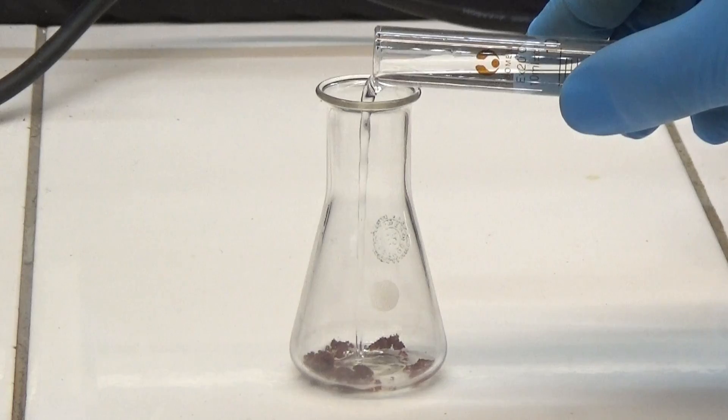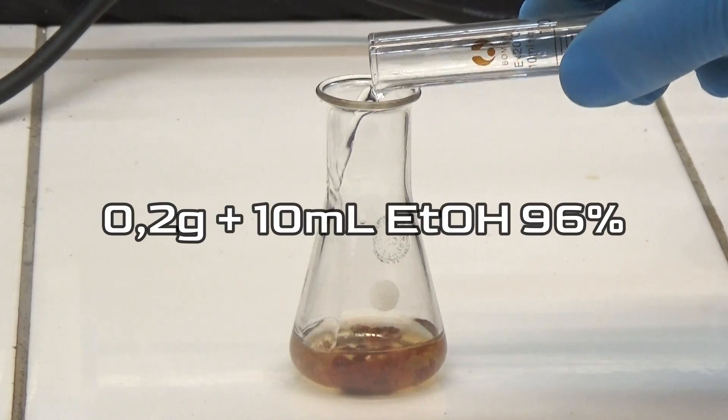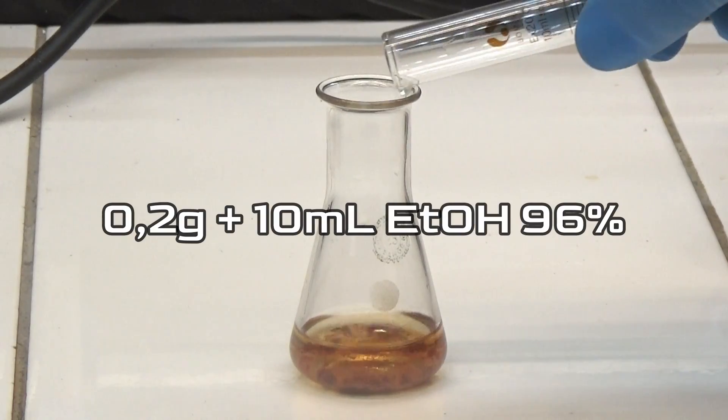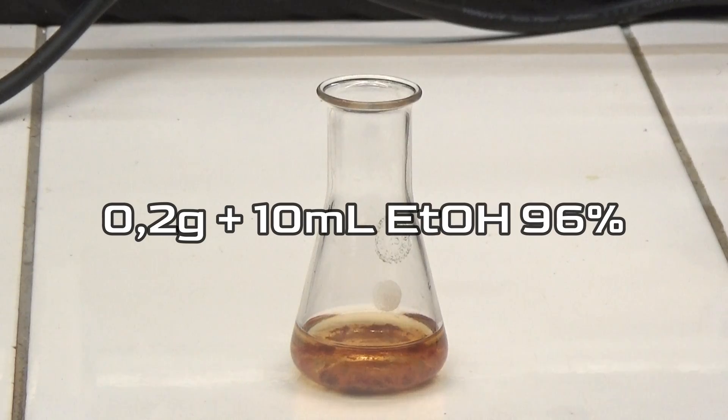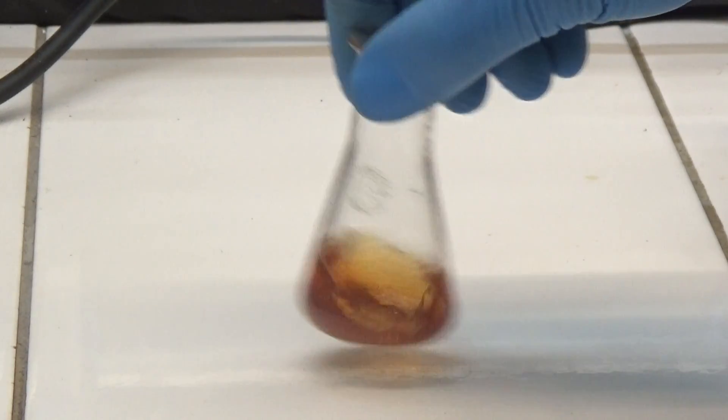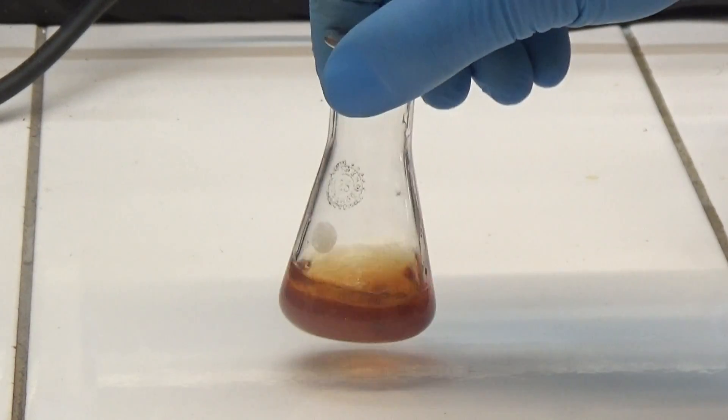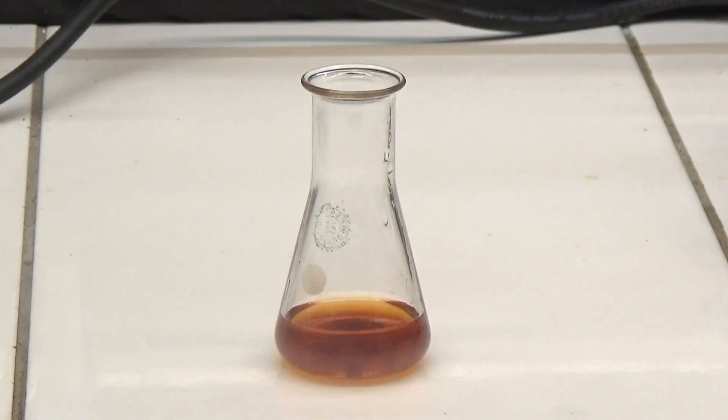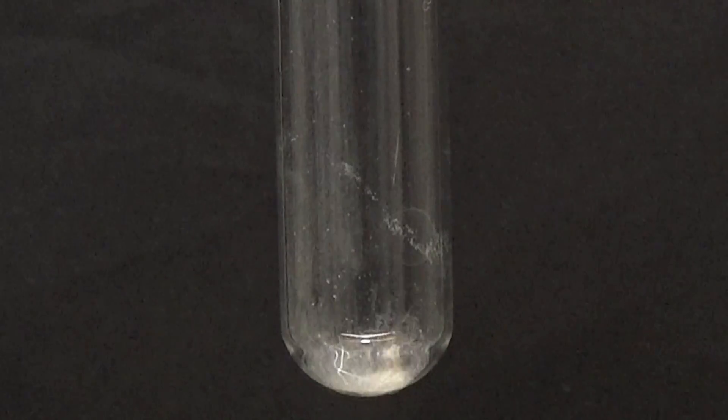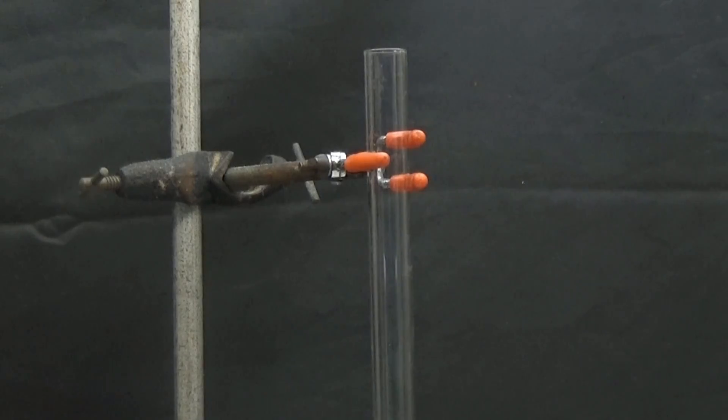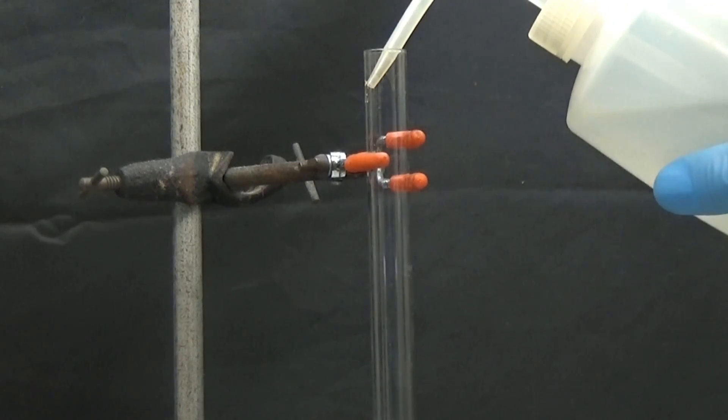To prepare the amino acid reagent, first we prepare a 2% ninhydrin solution by dissolving 200 mg in 10 ml of 96% ethanol. In a test tube, we put a little glycine, an alpha amino acid, and dilute it with 10 ml of distilled water.